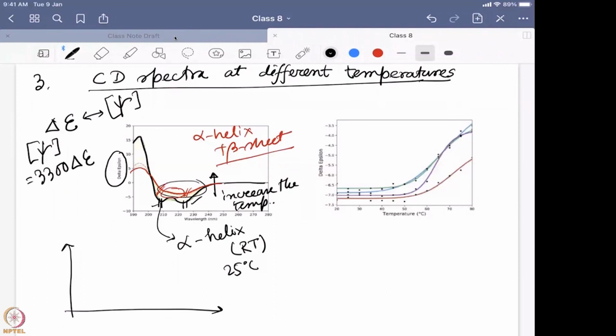But if I normalize with respect to concentration, using molar ellipticity or better delta epsilon, it becomes a concentration-independent parameter. No matter what concentration you use anywhere in the world or galaxy, say someone uses 1 millimolar in the US and someone uses 10 millimolar in India, you should see a similar amount of change because delta epsilon takes care of the concentration.